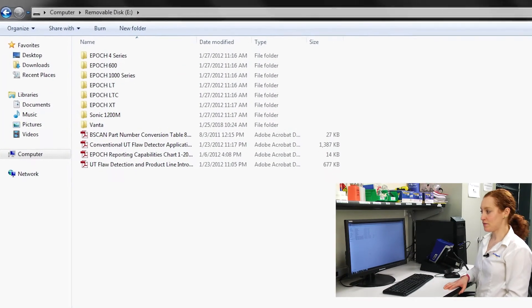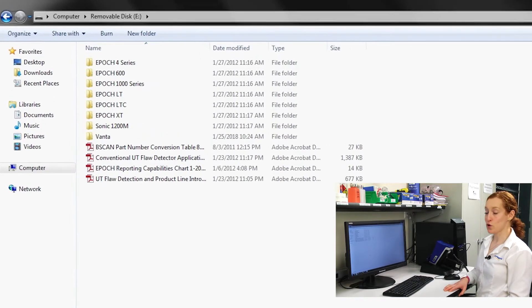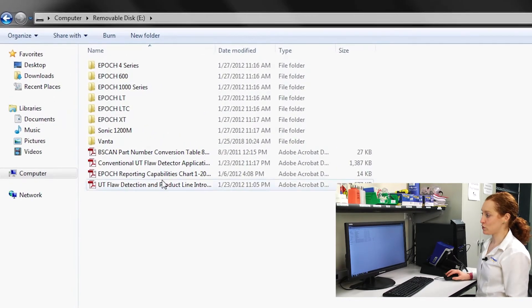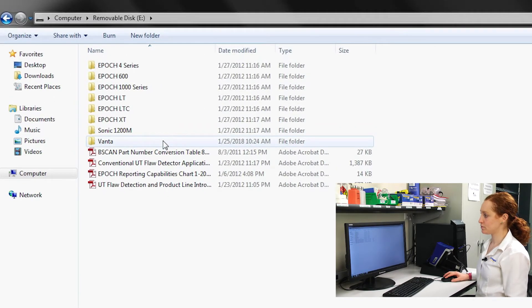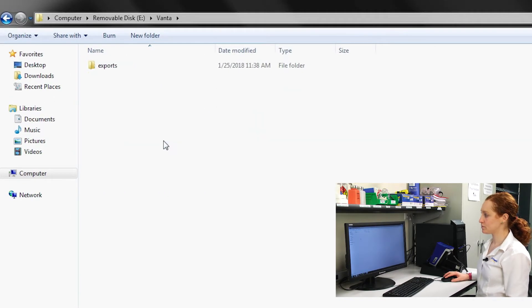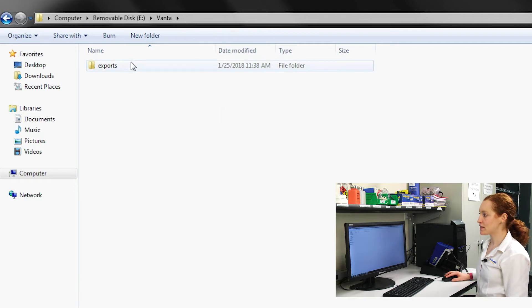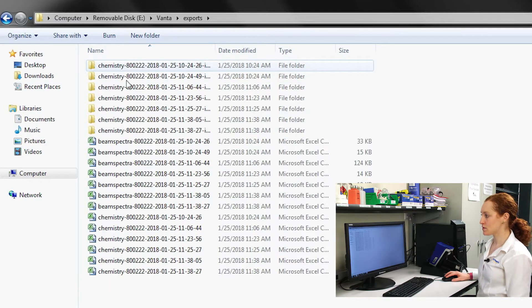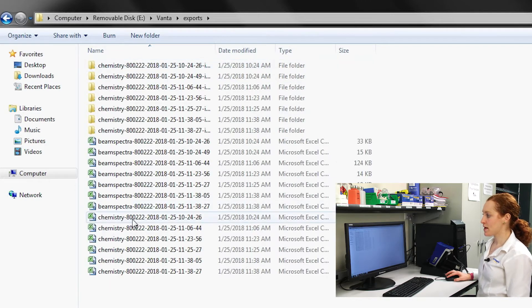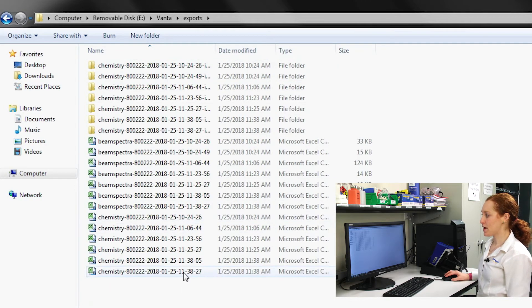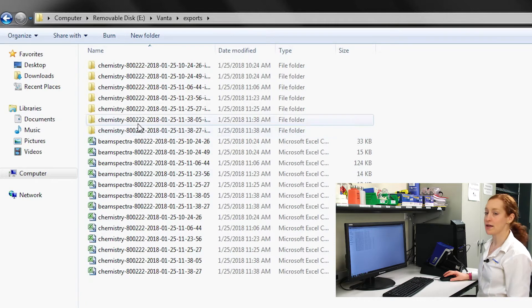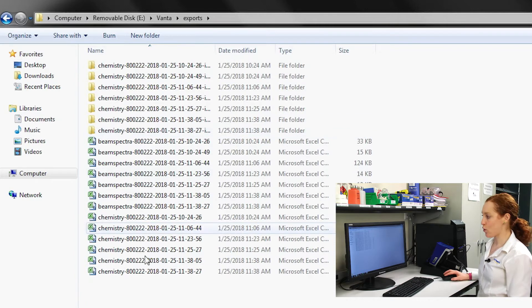On my USB device, a folder called Vanta will be created. I can then select exports and my chemistry, beam spectra, and image files will all be there.